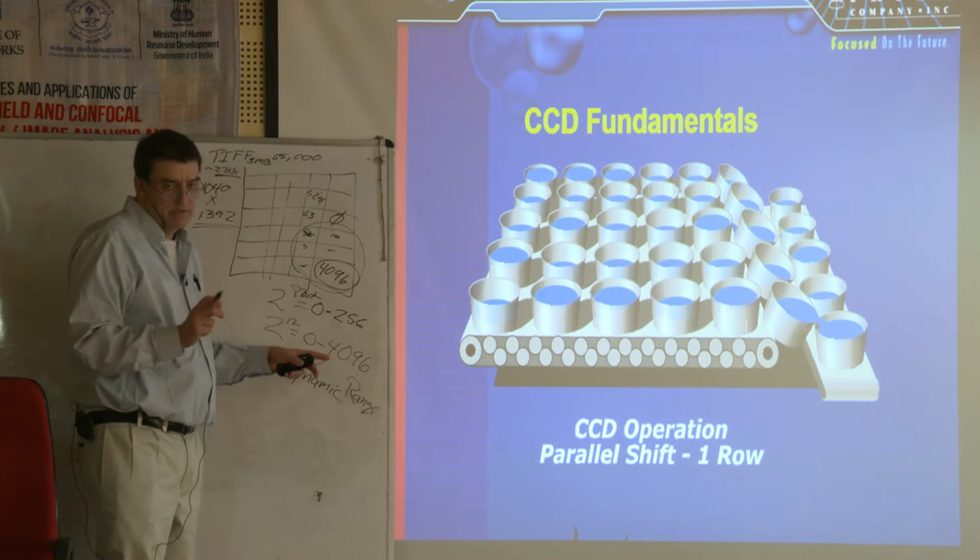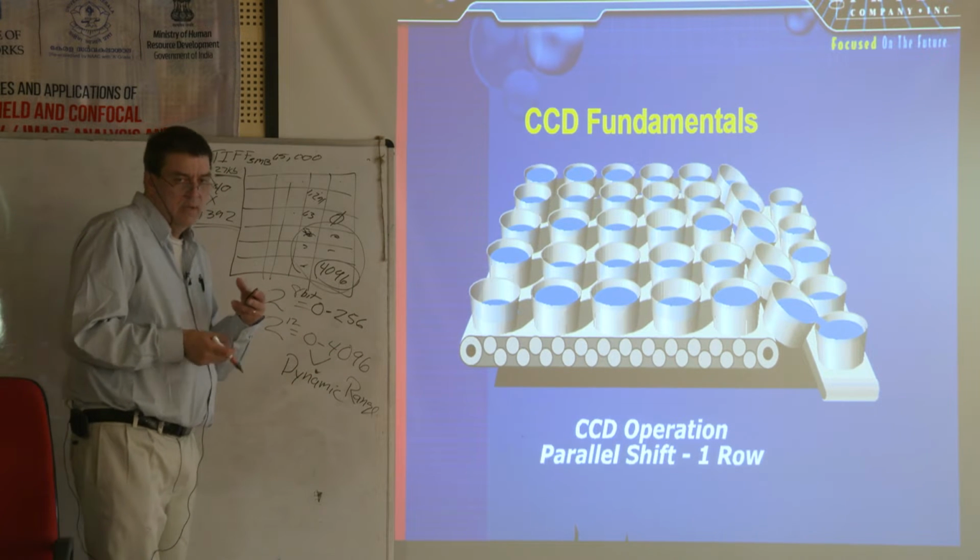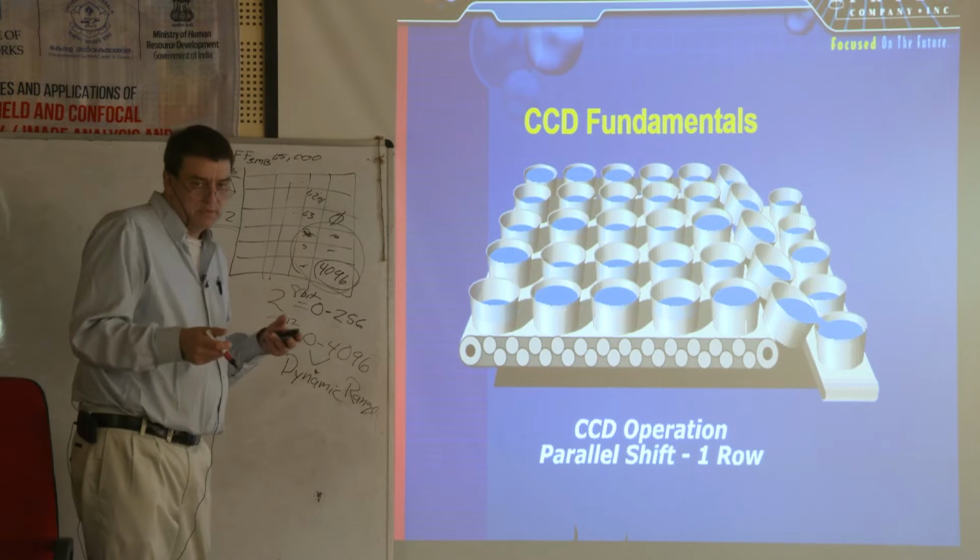And we get MetaMorph out. I'll show you some more of this. I just want to sort of introduce it right now. But when I actually pull up images of MetaMorph, it'll make more sense. Okay?